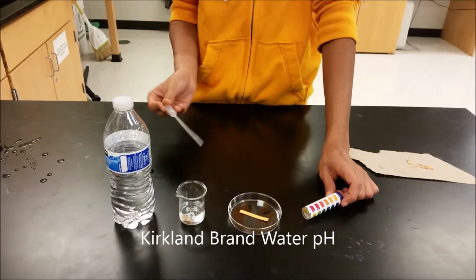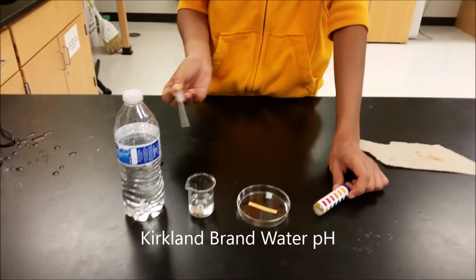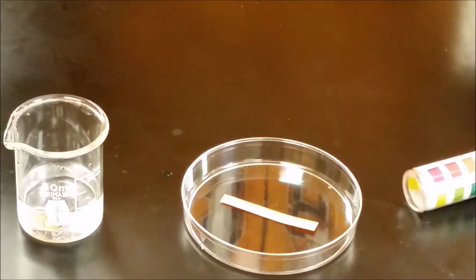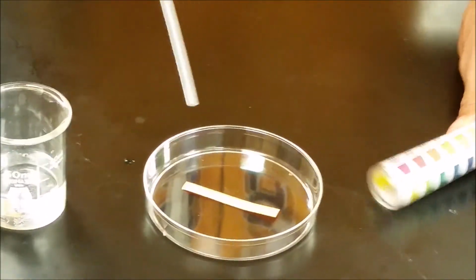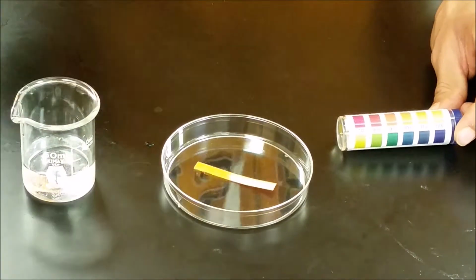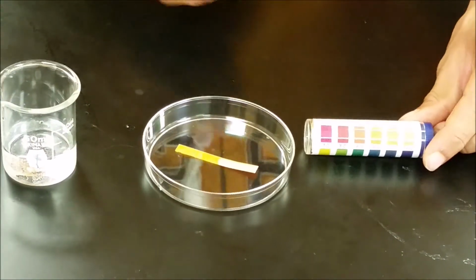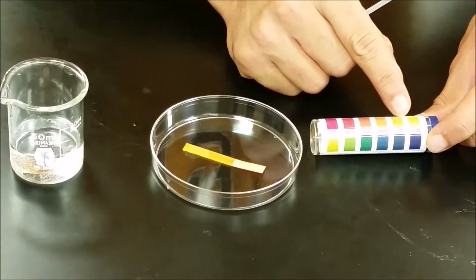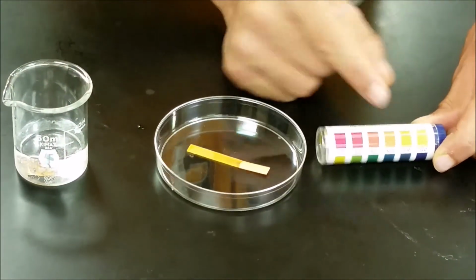Okay, here we have 40 milliliters of Kirkland brand drinking water. I took a bit of the water and put it into this pipette, and we have pH paper right here to tell what the pH of this water is. Okay, so as you can see, the color changed to about a 5 or 6, kind of in between.